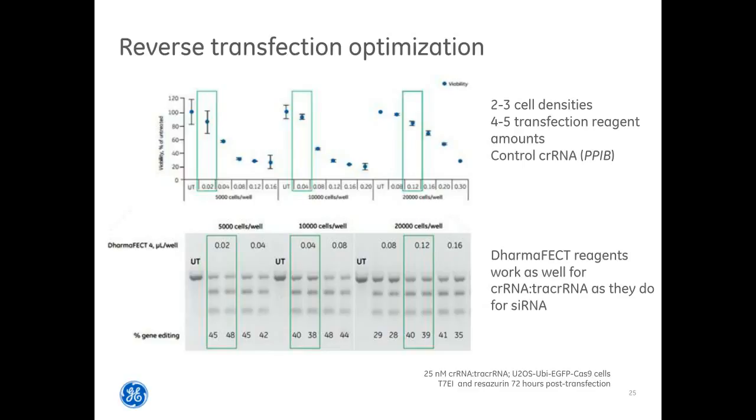So although the screen results I'll be showing you later were done with forward transfection, we know from our extensive interactions with screeners and our own experience screening that reverse transfection is often preferred. So I thought it might be of interest to show an example of that here.